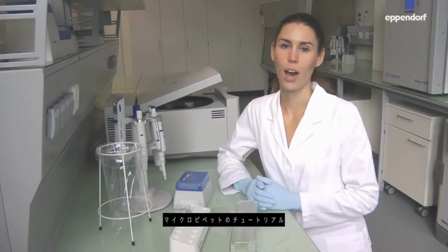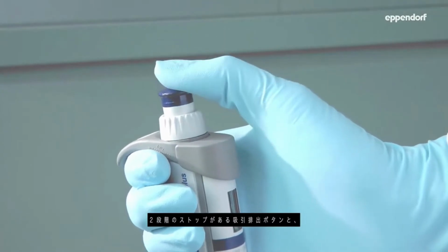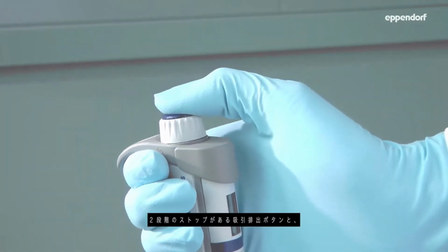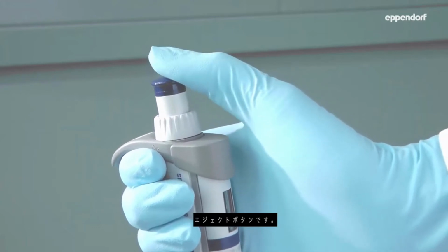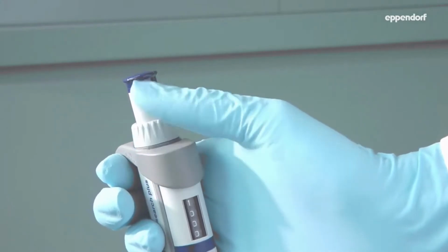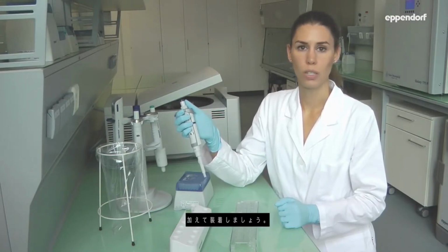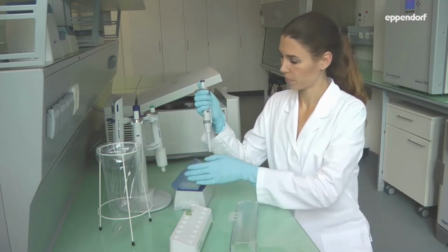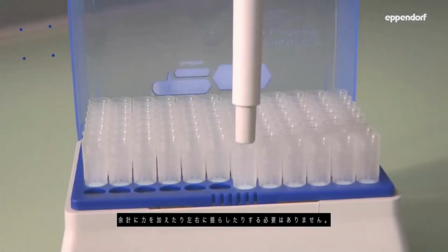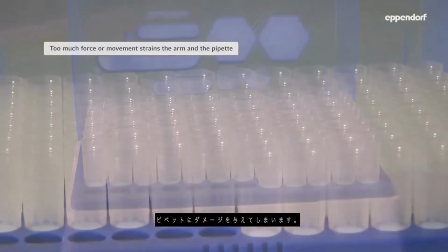To the pipetting tutorial, how to pipet correctly. I'm using a two-button pipette. It has a control button with two stops and an ejector button. Pipetting starts when you attach the tip. Apply light pressure to insert the pipette into the tip. There is no need for force or moving from side to side. This would only strain your arm and damage the pipette.